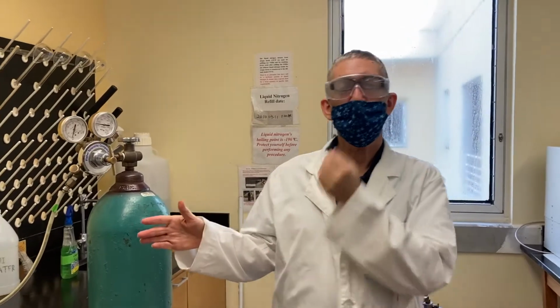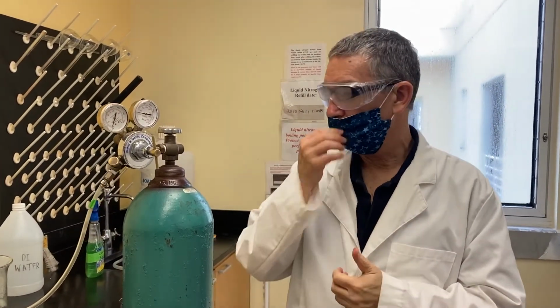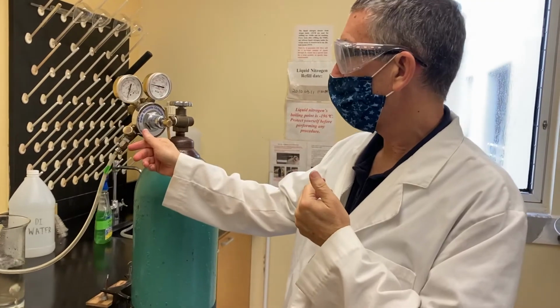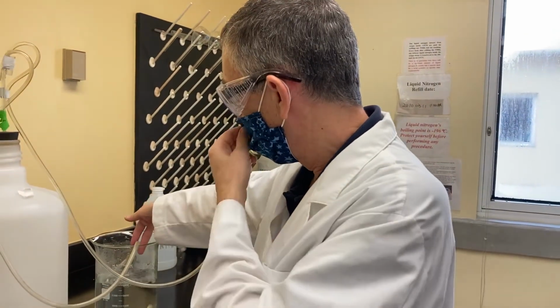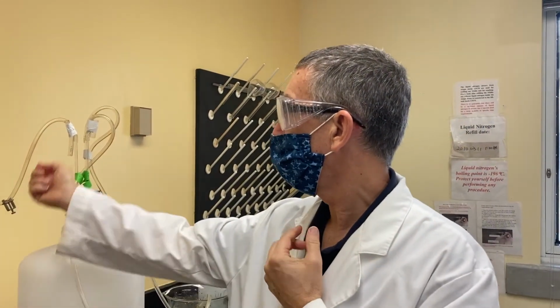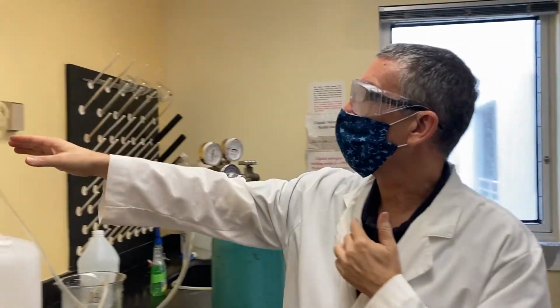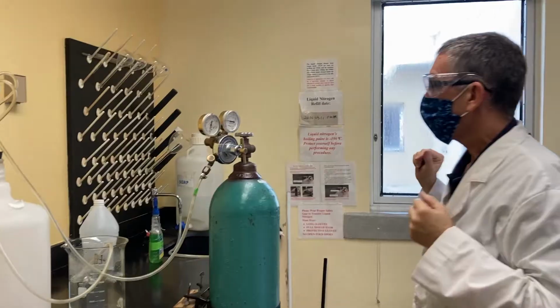Okay, so now we have purged for 15 minutes and we're ready to begin our experiment. So I'll tell you what's going to happen, then we'll do it. We're going to stop the gas from flowing, and then we're going to close off the system, so this will be closed. Then we're going to open this, because we'll need to be reading pressures, and then we will establish a positive pressure here. We're going to add a little gas, but be very careful. We don't want to shoot it out.